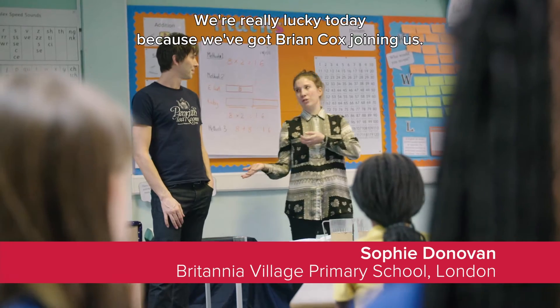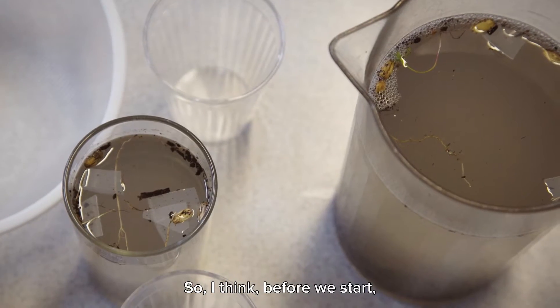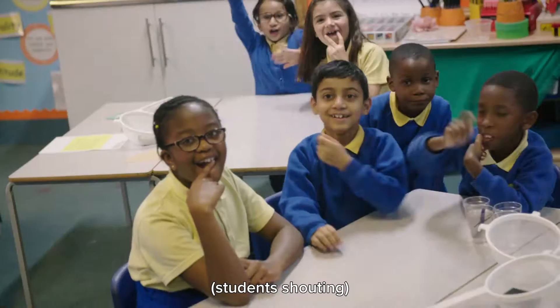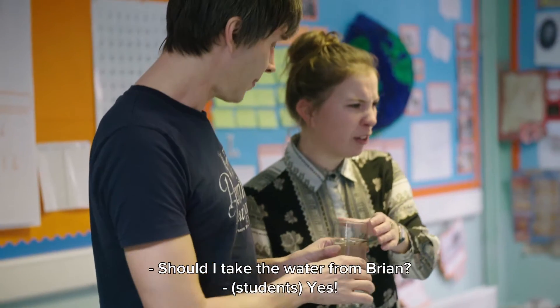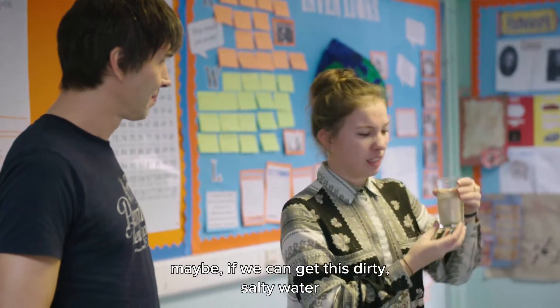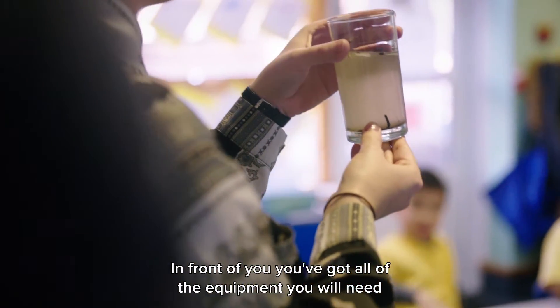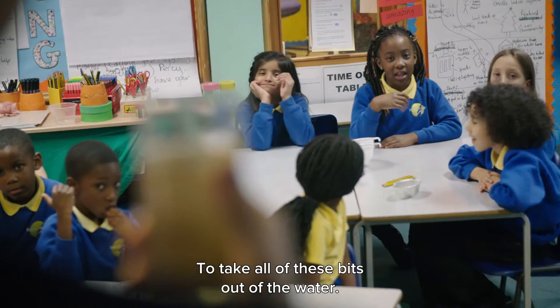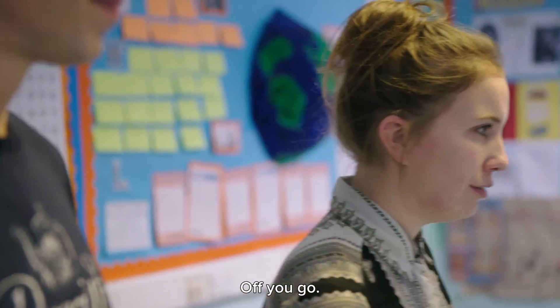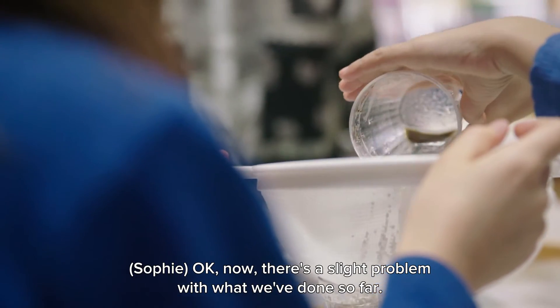We're really lucky today because we've got Brian Cox joining us — can we all say hello to Brian? I think before we start I'd like a drink, I'm a bit thirsty. So I wonder if we can get this dirty salty water and turn it into some nice drinking water. In front of you, you've got all the equipment you will need to carry out this investigation to take all of these bits out of the water. Do you think you'll be able to do that? Off you go!